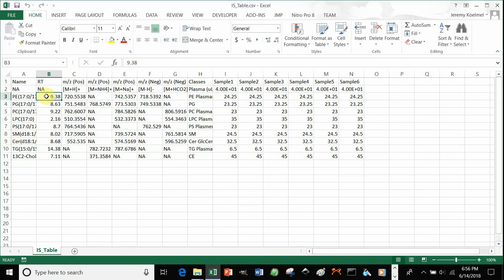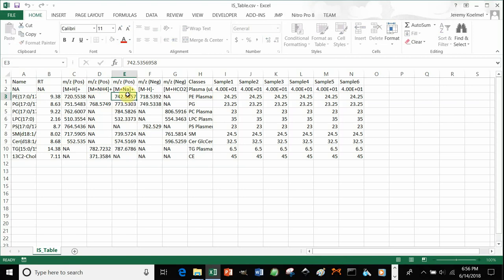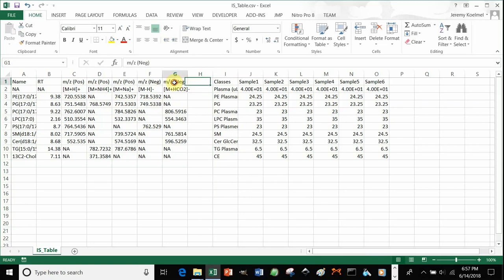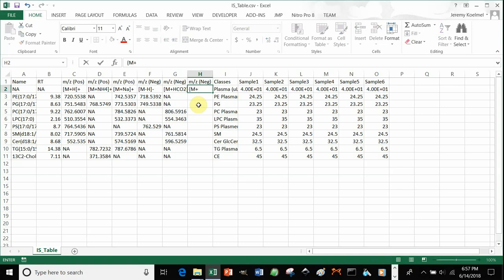Your feature table should have picked out the internal standards. You'll also have a column for each of the adducts that you would expect based on your chromatography and mass spectrometry method. You can insert additional columns here — for example, if you had a formate column and now you also had an acetate column, you could add your acetate column here.